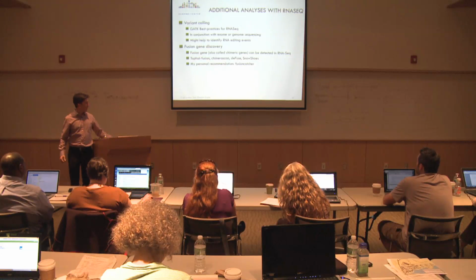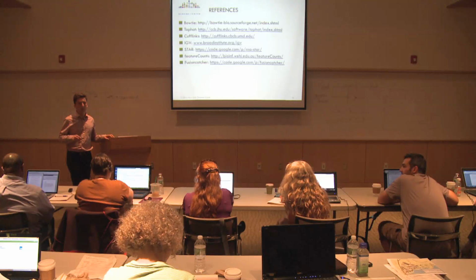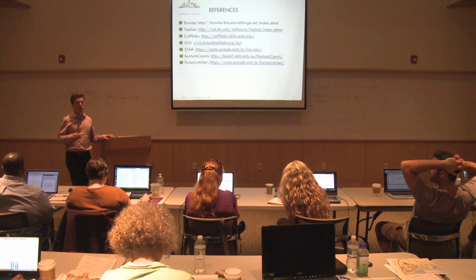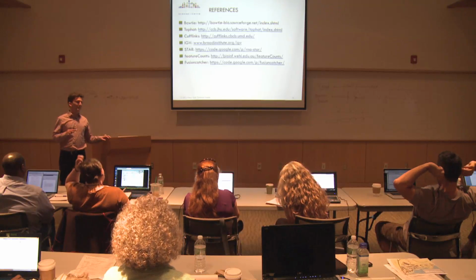And I think that's it for today. References: here are the websites of some of the tools I described. I didn't put all of them, but I'll find a way to send you the missing links. The ones for quality control are Picard, RNA-SeQC, and RSeQC, and I'll send the links for those. You have the slides, yeah, we have all the slides.